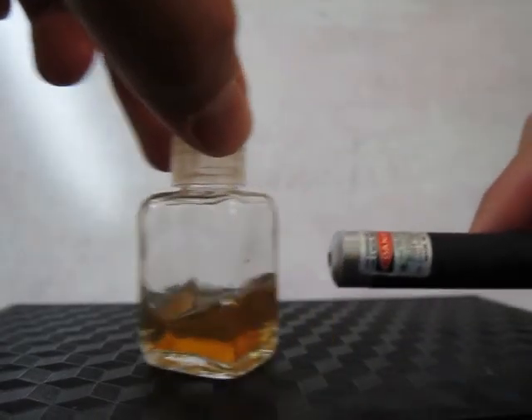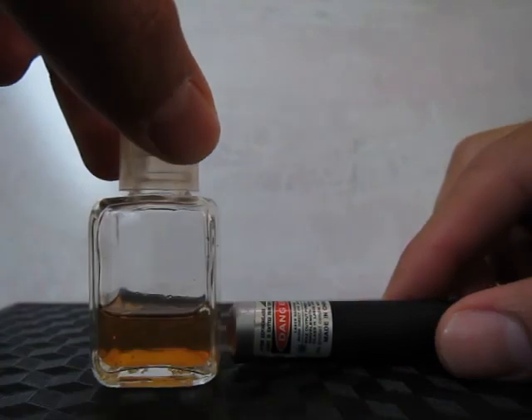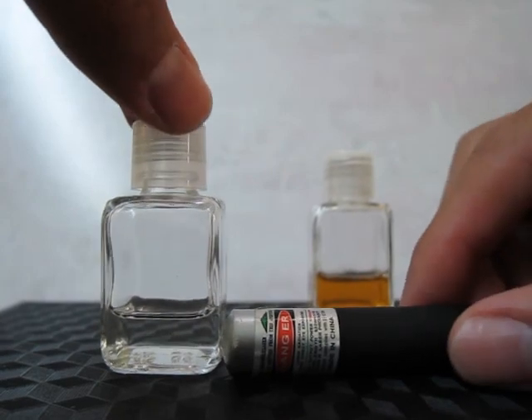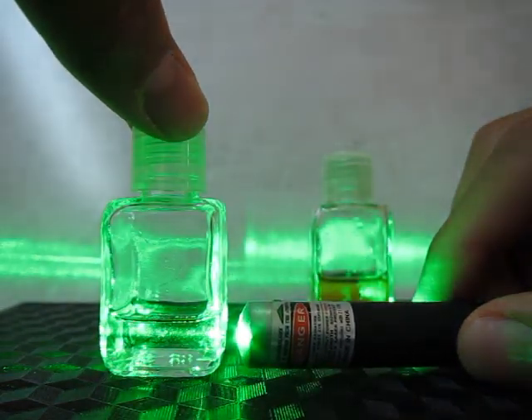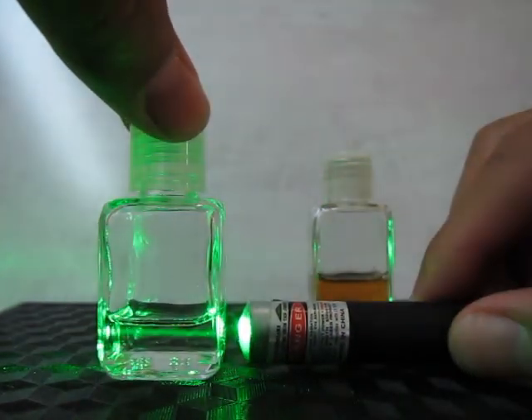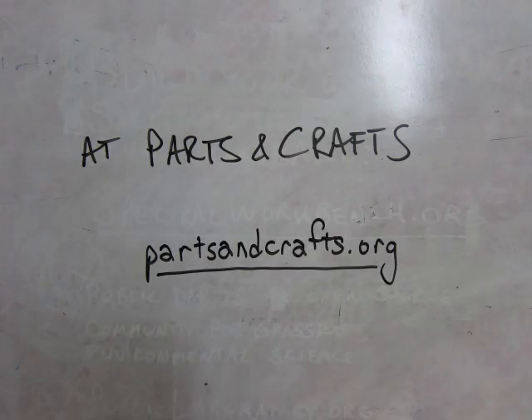You may be able to get it to fluoresce using a green laser. The square sides of the bottle allow the laser to pass through straight, but the distinct yellow or orange color is from the sample itself. For comparison, try this with plain mineral oil and see how only the green of the laser is present. The exact spectrum of colors measured with the spectrometer may help to identify what your sample was actually composed of.